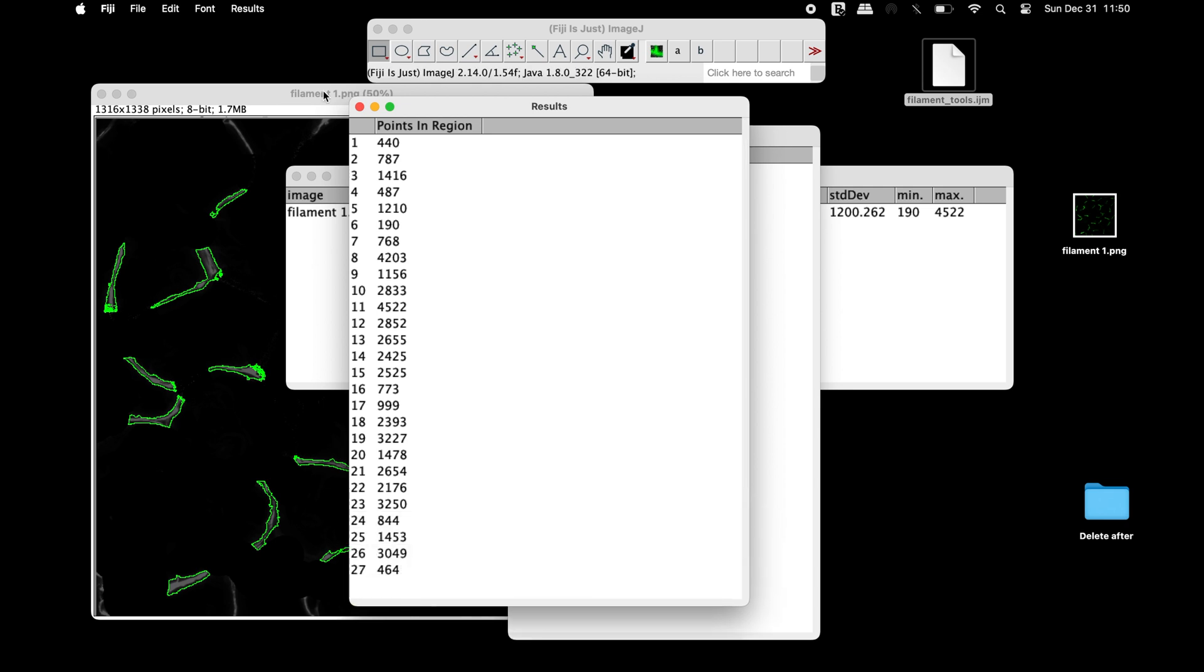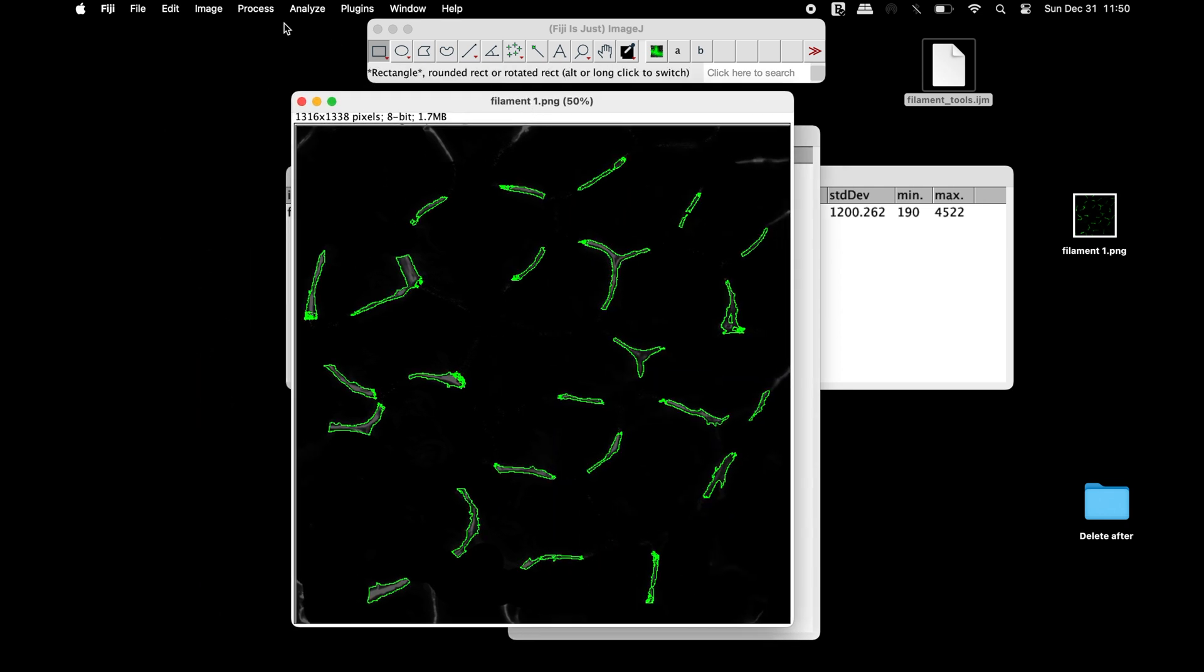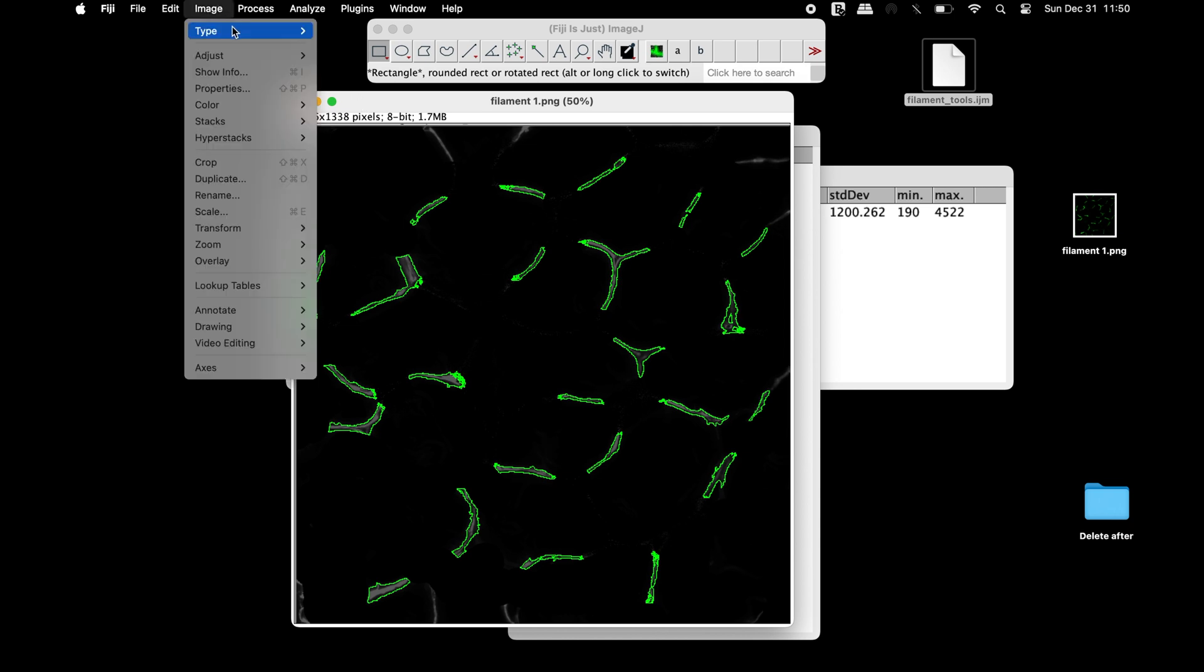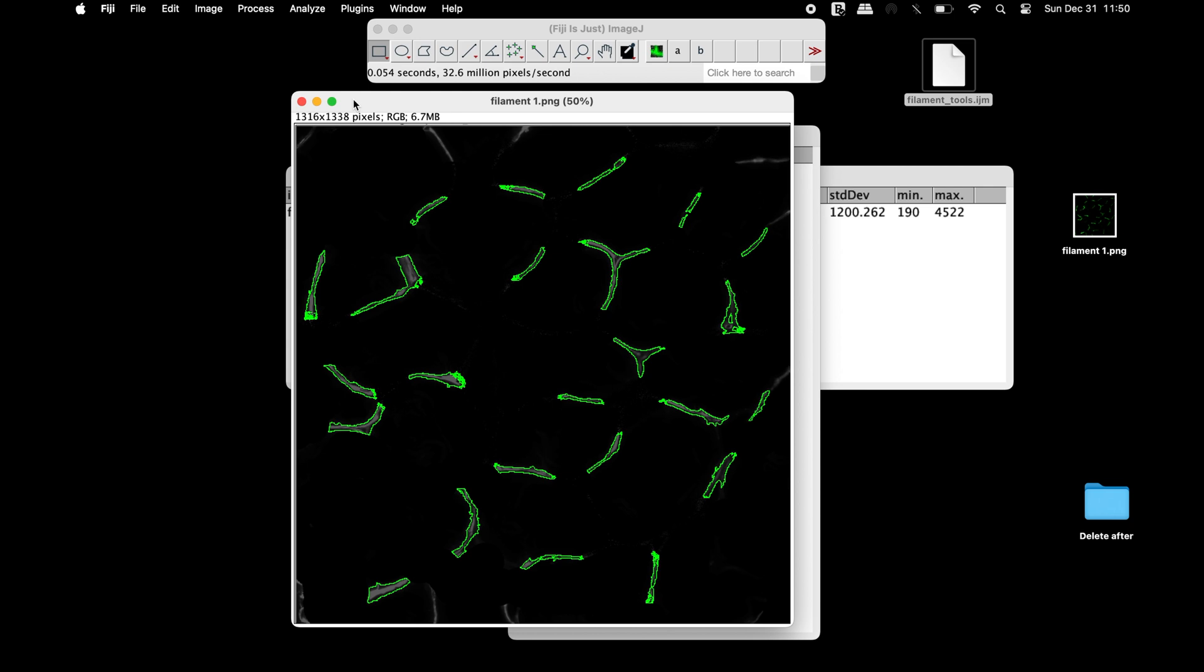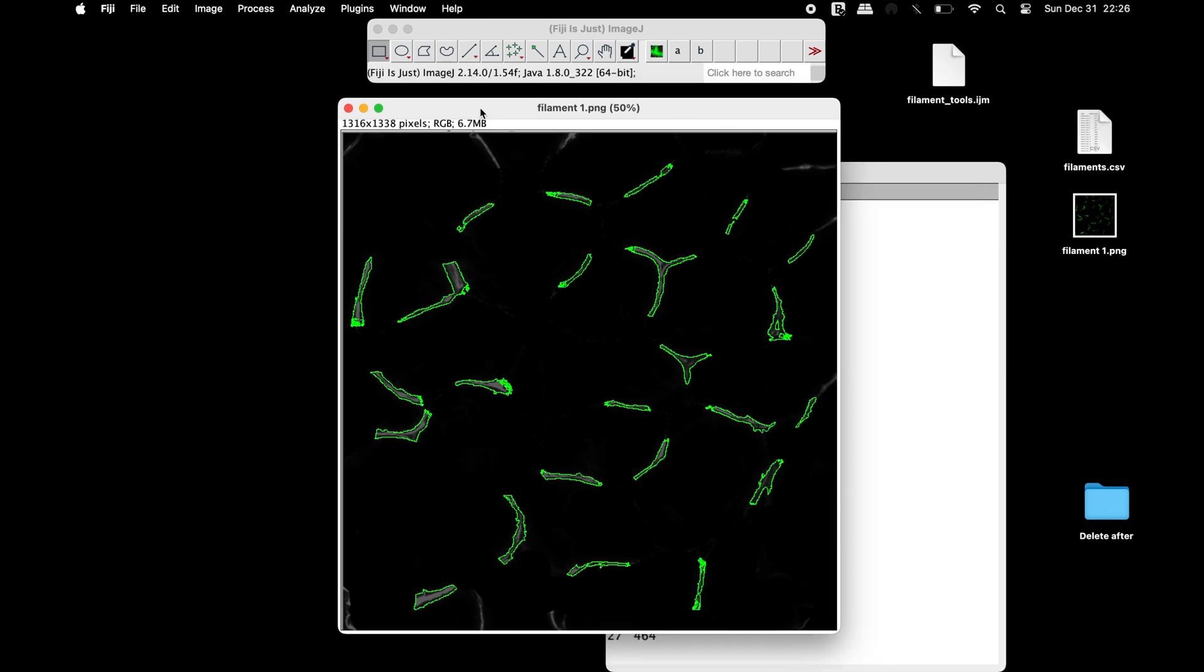To save a copy of the outlined image of the filaments, first, the image can be converted into an RGB format.